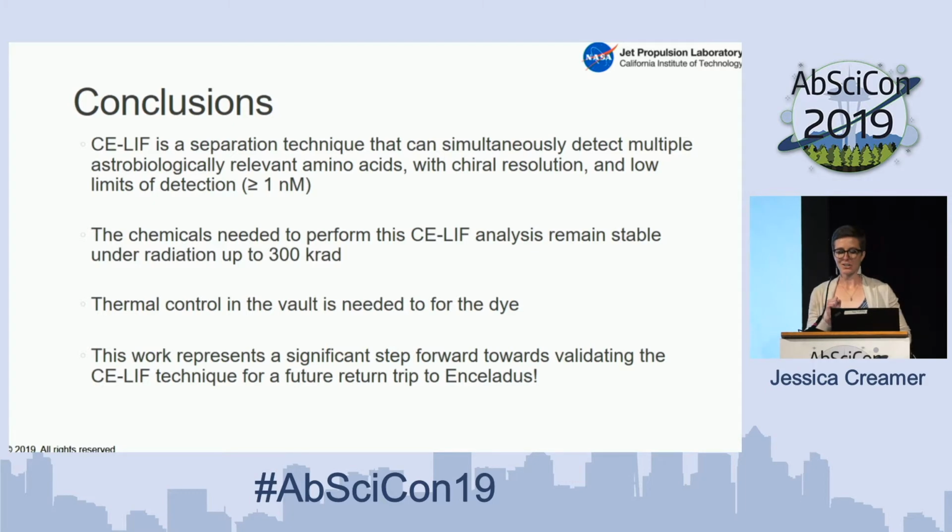So CE is a great technique. It can provide chiral resolution and very low limits of detection. The chemicals needed to perform this assay are stable up to 300 kilorad, which makes them viable to fly just about anywhere. We will need a thermal control in the vault to keep the dye at a lower temperature so it doesn't start to degrade. But these are the first steps in making this technique more viable for a future trip to Enceladus.